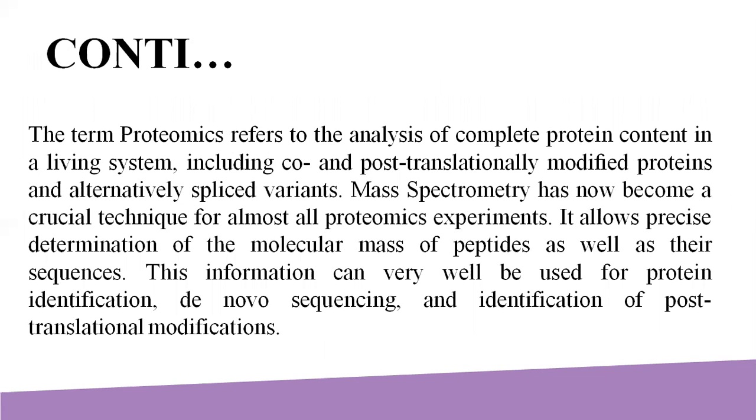Mass spectrometry has now become a critical technique for almost all proteomics experiments. It allows precise determination of the molecular mass of peptides as well as their sequences. This information can very well be used for protein identification, de novo sequencing, and identification of post-translational modifications.